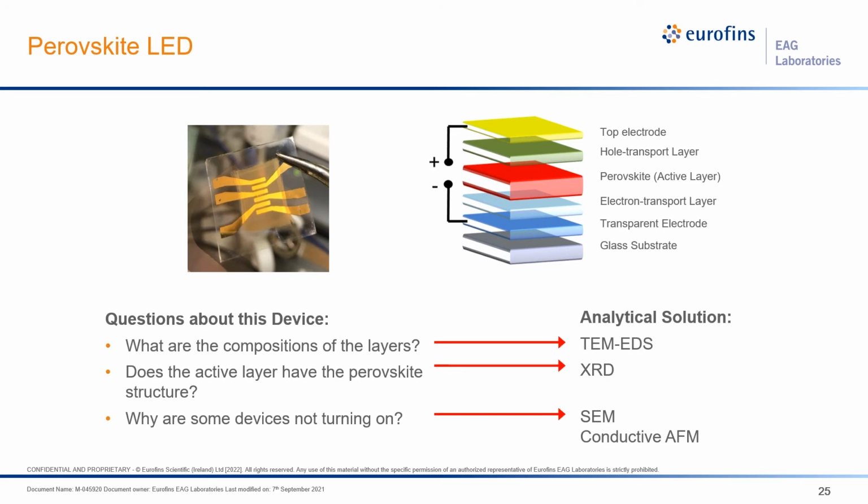We recently collaborated with a summer intern from the University of Santa Cruz on developing perovskite LED materials. This was a large project that used several analytical techniques, but unfortunately going into the full details is beyond the scope of this webinar. Just know that we used TEM EDS to analyze the composition of the layers, and then XRD to characterize the crystal structure.